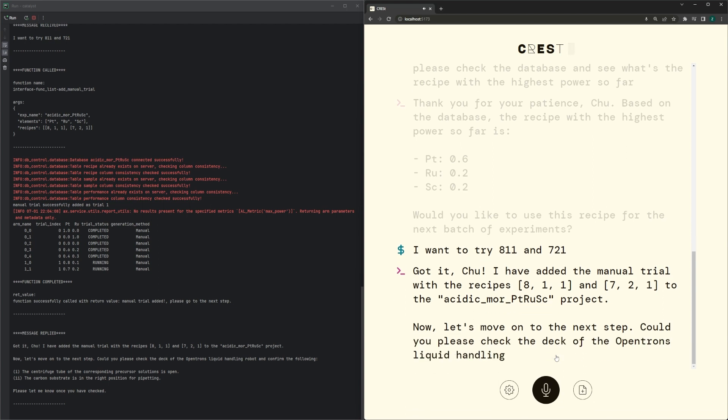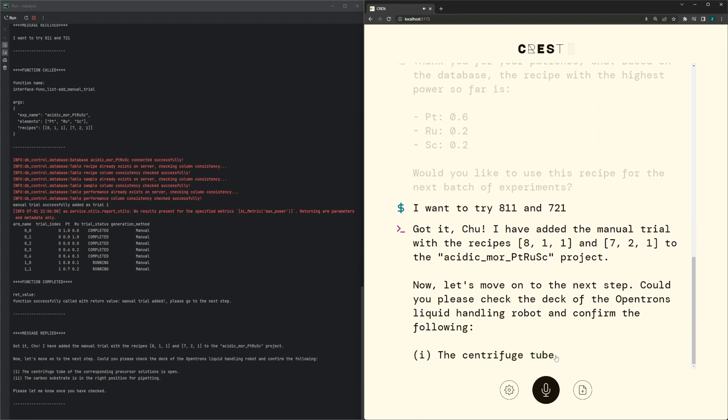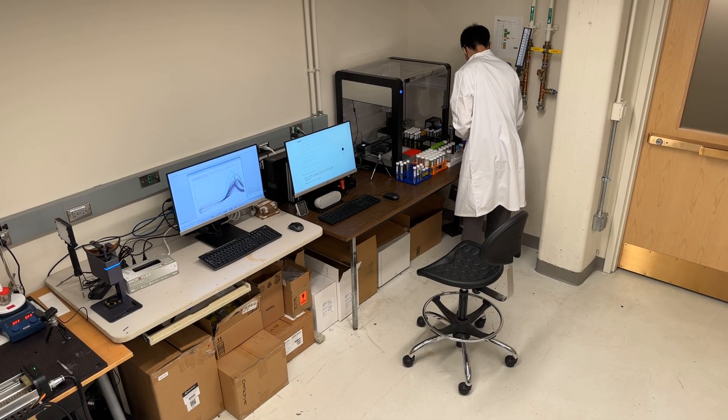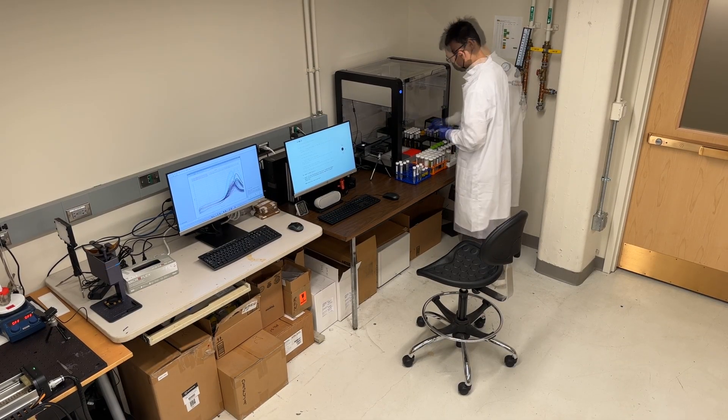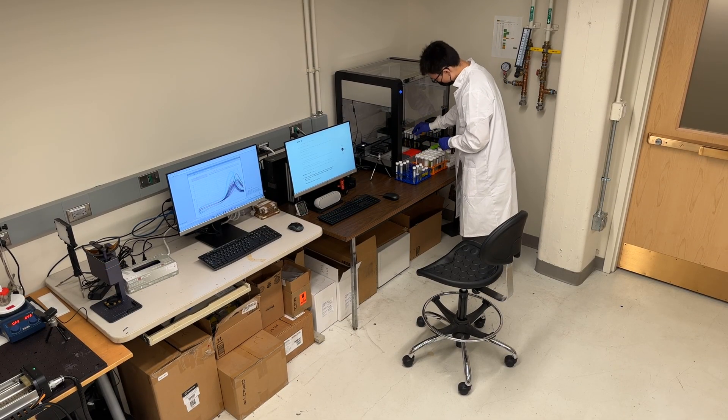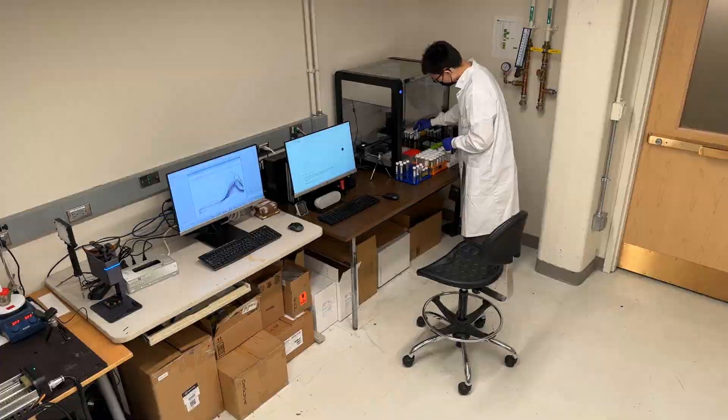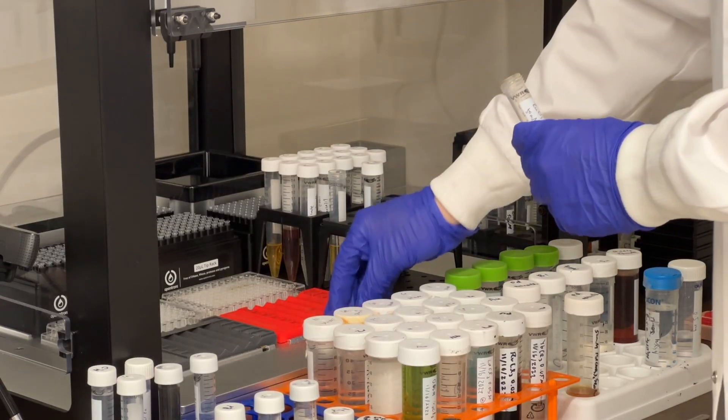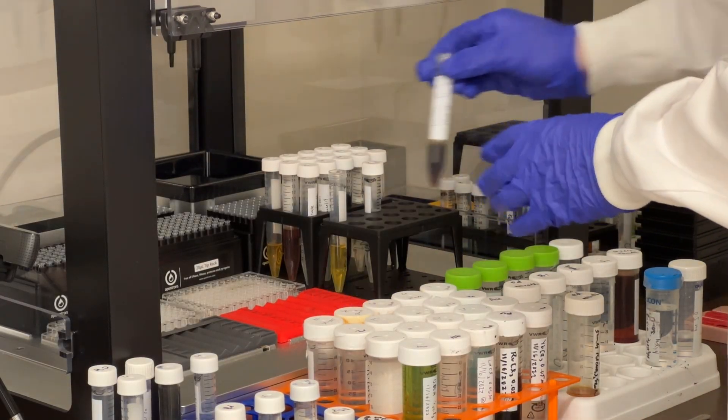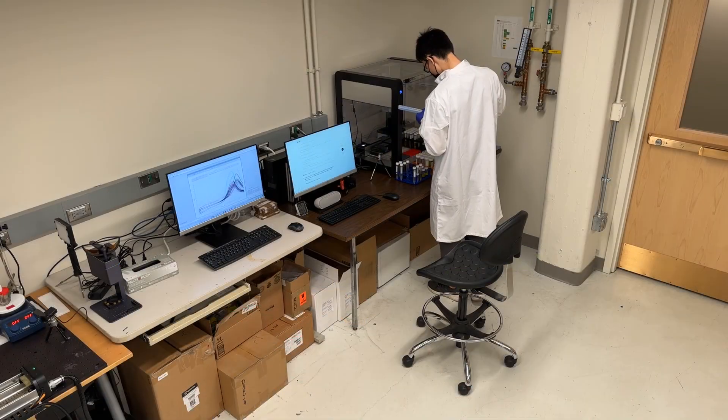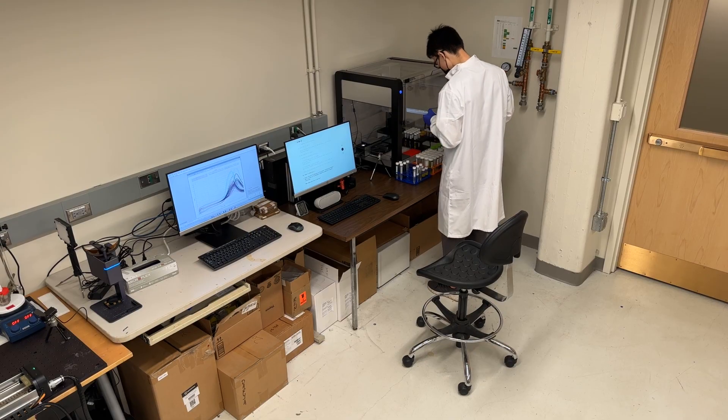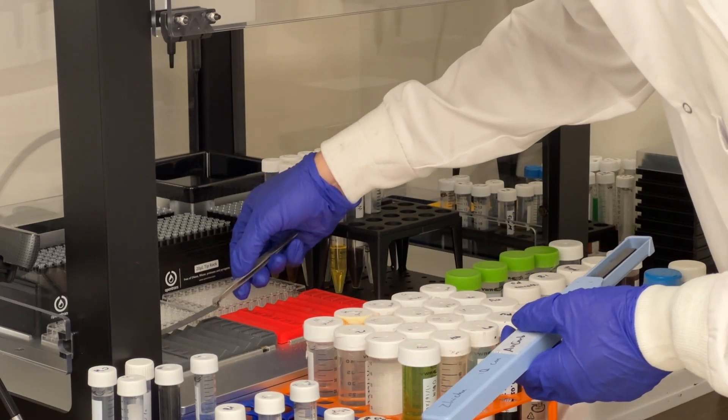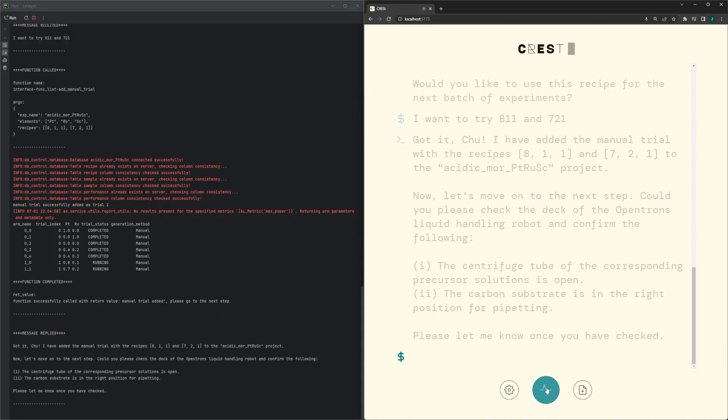Now let's move on to the next step. Could you please check the deck of the Opentron's liquid handling robot and confirm the following? First, the centrifuge tube of the corresponding precursor solutions is open. Second, the carbon substrate is in the right position for pipetting. Please let me know once you have checked. Yes, I've checked. They're ready.